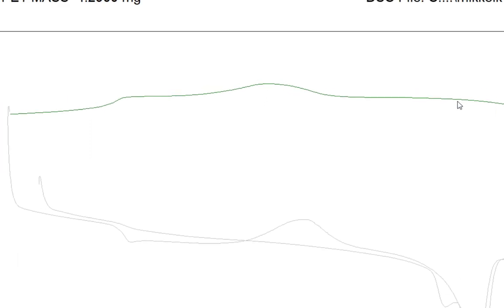And then, so as we go back down on the cooling, our sample is now melted. And so as it cools, it will crystallize. So this crystallization is quite broad. And that's just because it's crystallizing relatively quickly, and we're on a fast ramp. So it's kind of spread out because we're on a fast cooling rate. So we have 20 degrees a minute of cooling rate, that it kind of spreads out that crystallization peak.